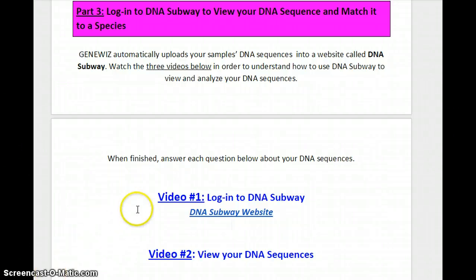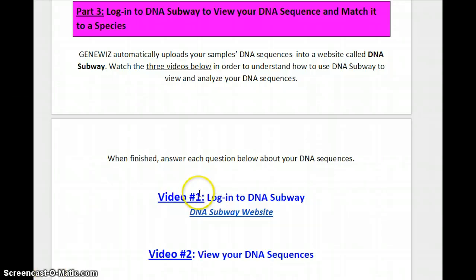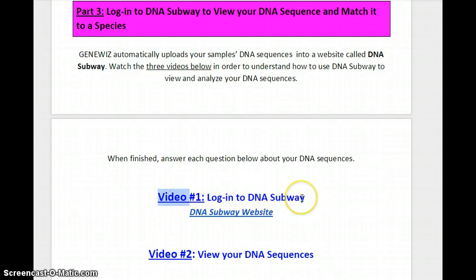Hi guys. I'm going to go ahead and show you the first video. This first video will cover how to log in to DNA Subway.